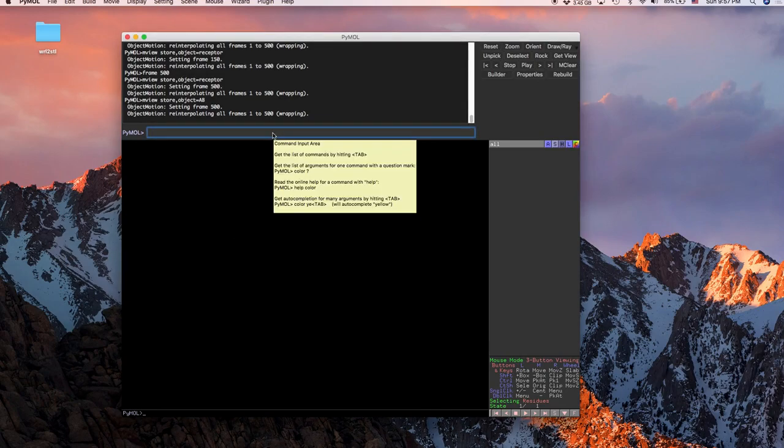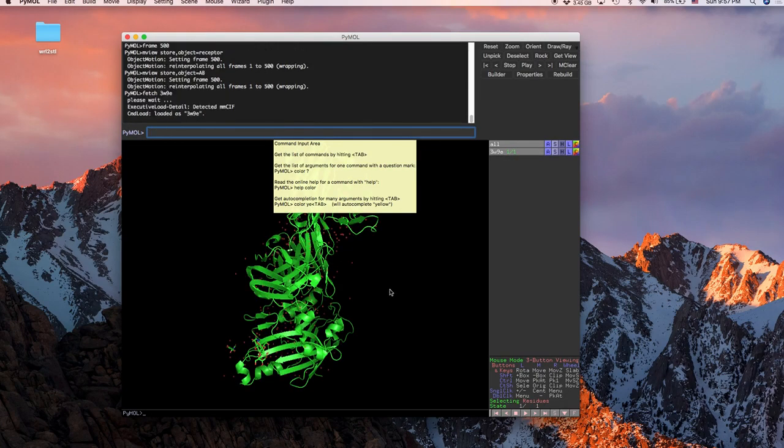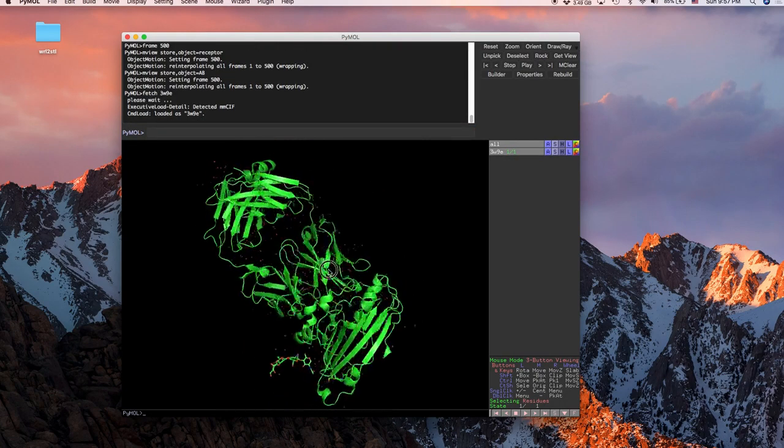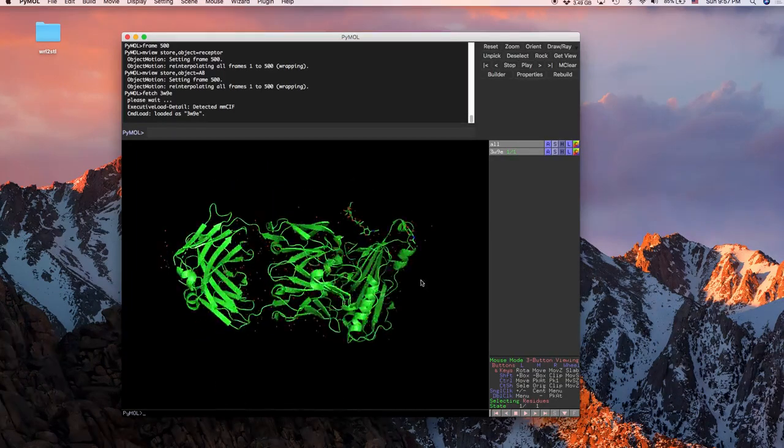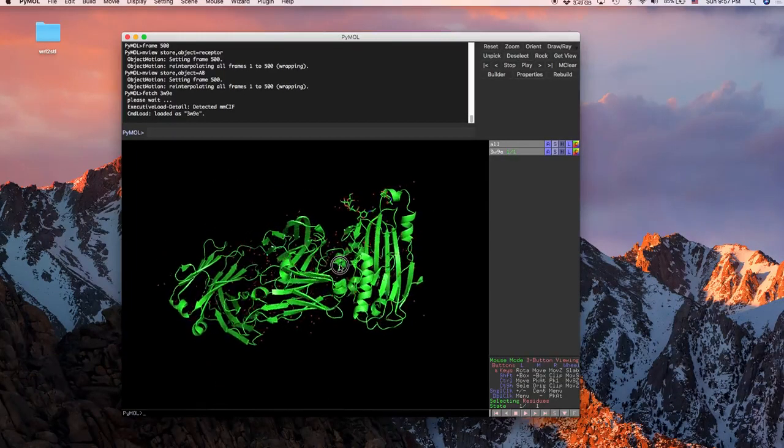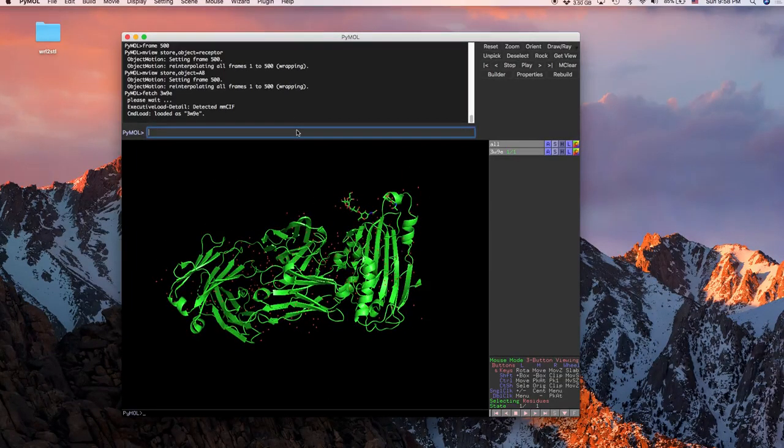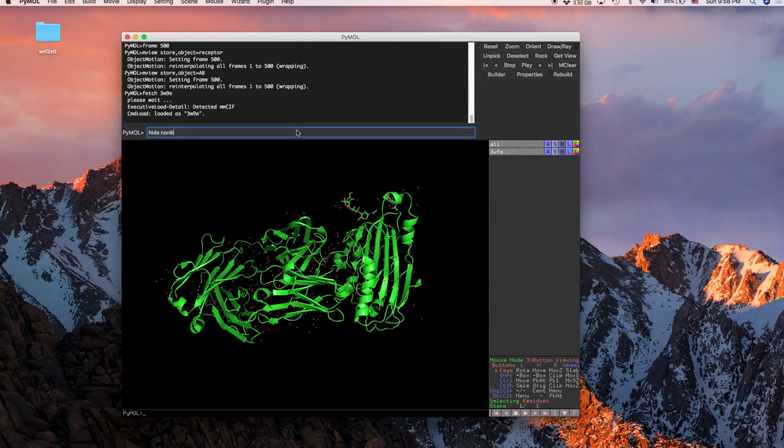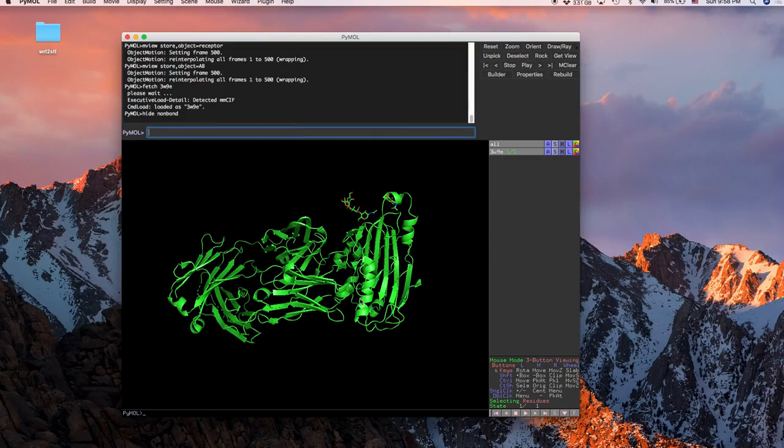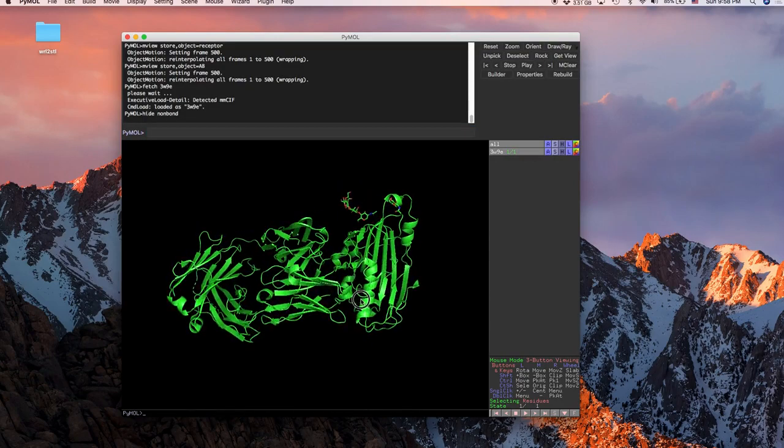So we'll just start off by getting our molecule in our workspace. Okay, here is our molecule that we're going to be working with and I don't want any of these non-bonded, so we're going to hide, we'll get rid of all those little red dots everywhere.